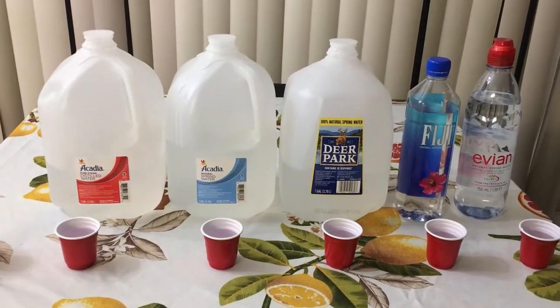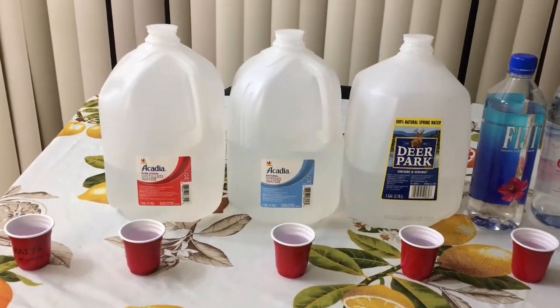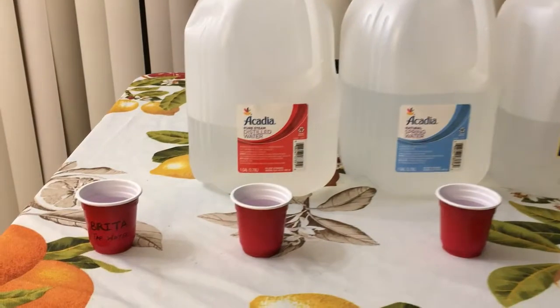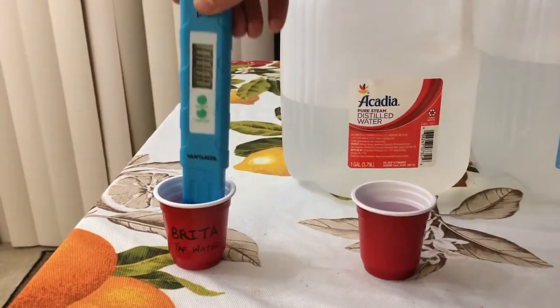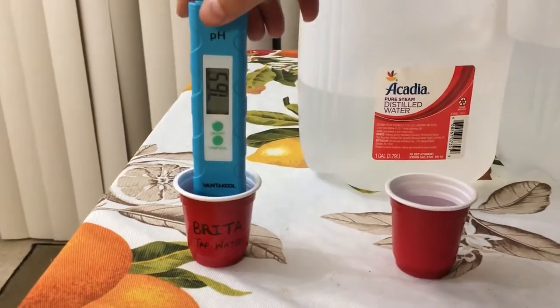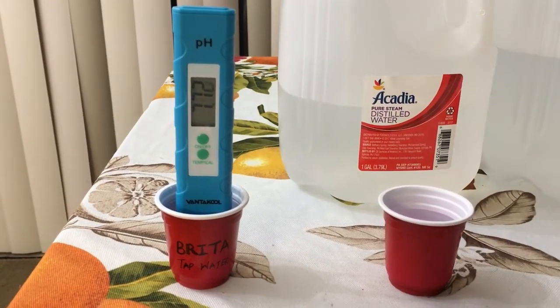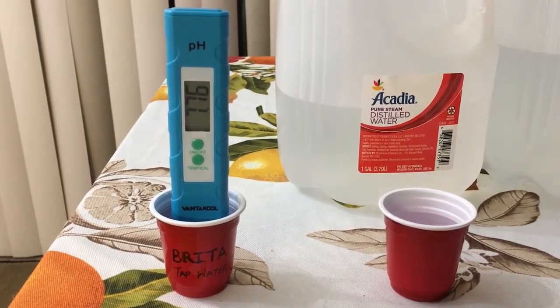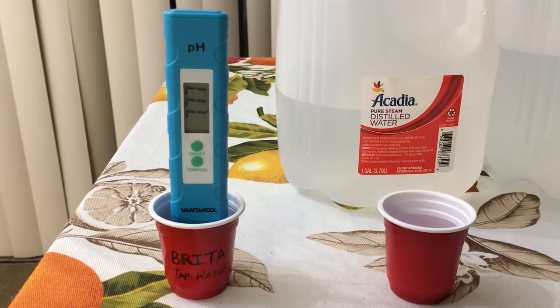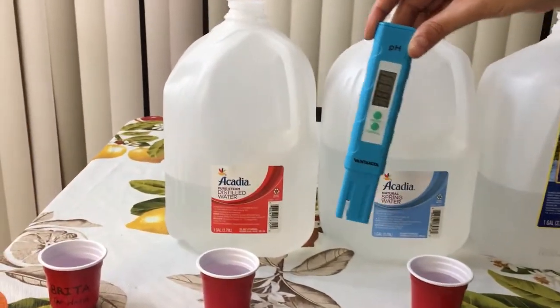As you can see, I have taken the respective water samples. I will start the pH test from my left — here I have Brita tap water, so let's see what it shows. Now I'll move on to Acadia distilled water.